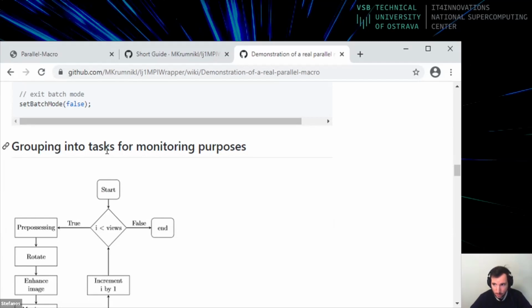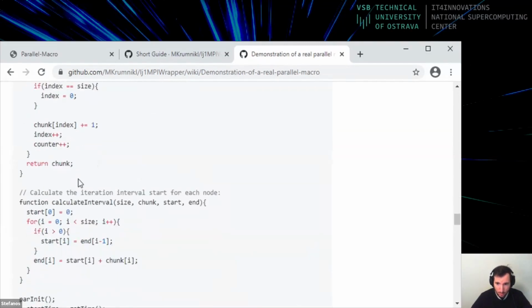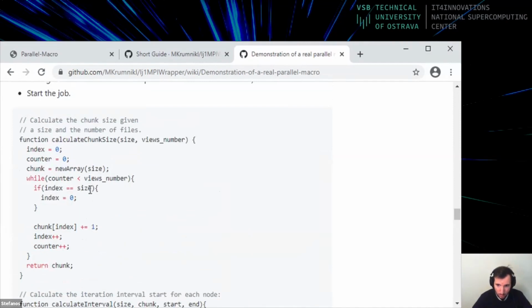If you run it on your local machine, it's a different machine than those computers that exist in the cluster, and we want to compare the time between that serial code and this parallel code, which is the second snippet. So I'm going to show you now in the demo how to create these two jobs and start running this. We're going to leave them to run and see what the time is, so that we can compare. And then I'm going to explain what we did to parallelize this.